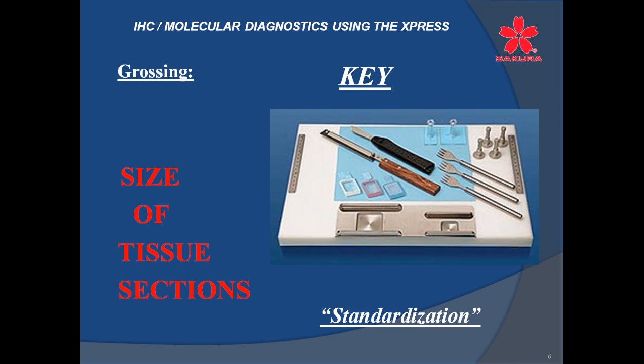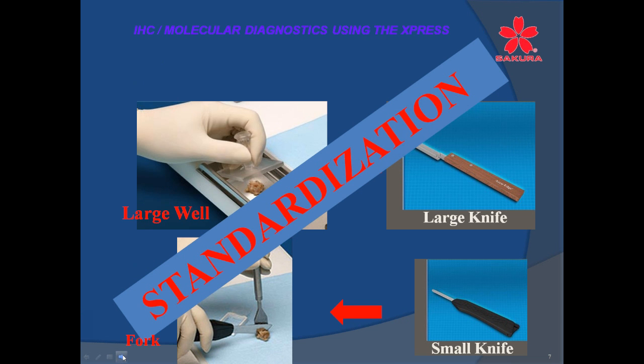And then once we can standardize the size of sections, that will be the biggest key, or should I say the largest key, in getting validation done in processing. Because this right now hinders a great deal of us, and this guesswork, when we have tools that make this precise, then we need to move forward in doing that. So size of sections really does make a difference.